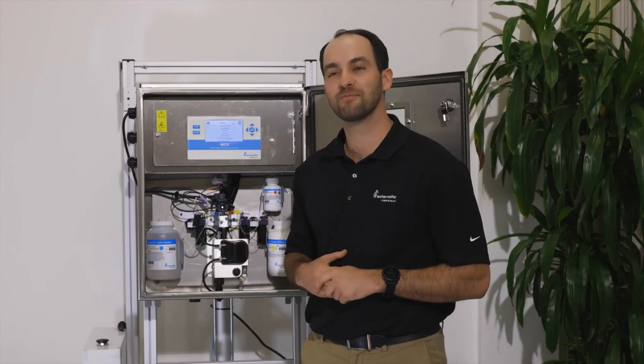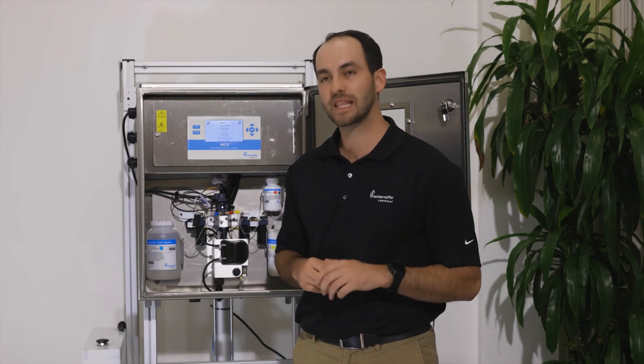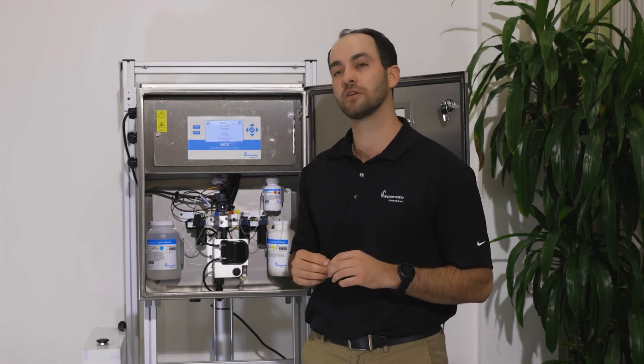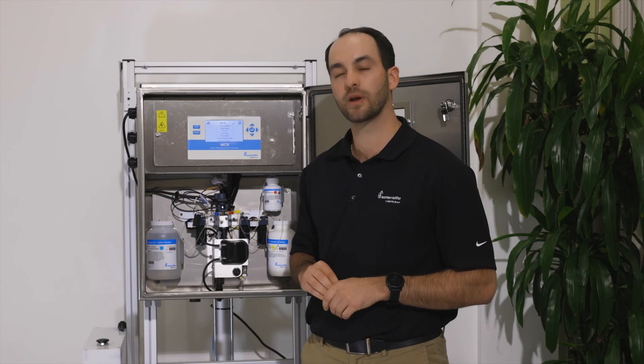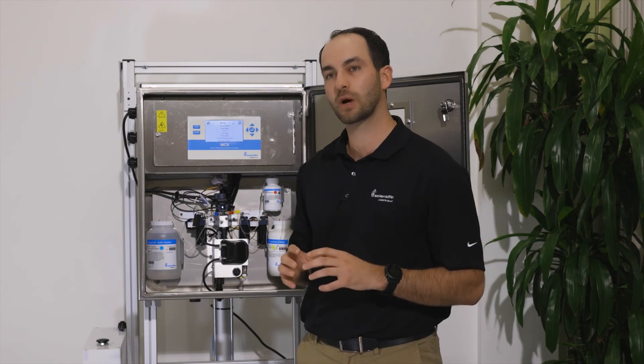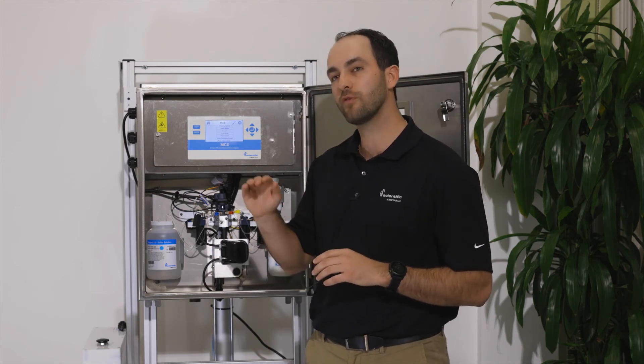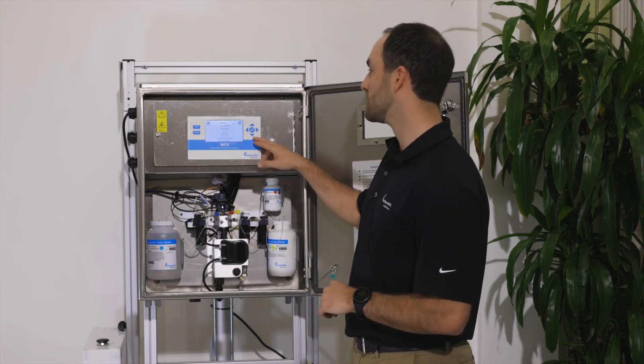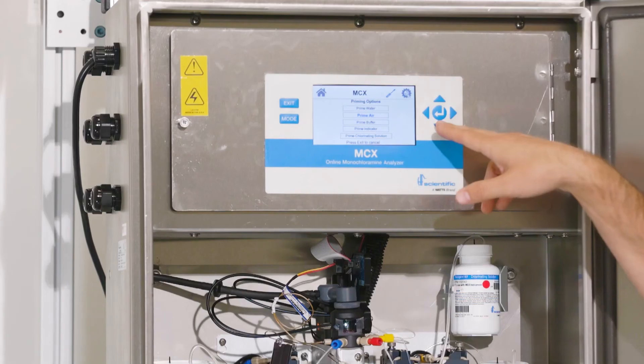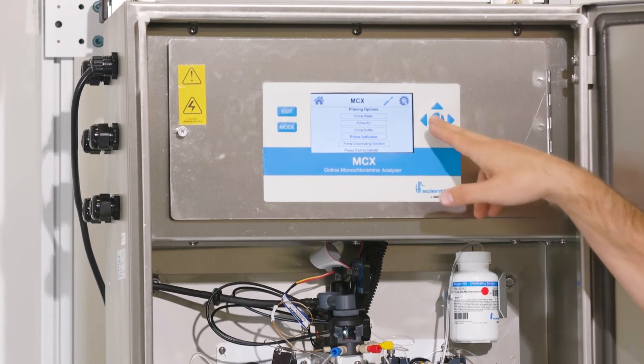The final reagent that we will prime is our indicating solution. The indicating solution is a tan color and it's the most viscous of all three reagents. We really want to make sure that we're seeing that tan color move all the way through the reagent lines and into the sample cell. So go up to your top screen, toggle down to prime indicator, and hit the enter button.